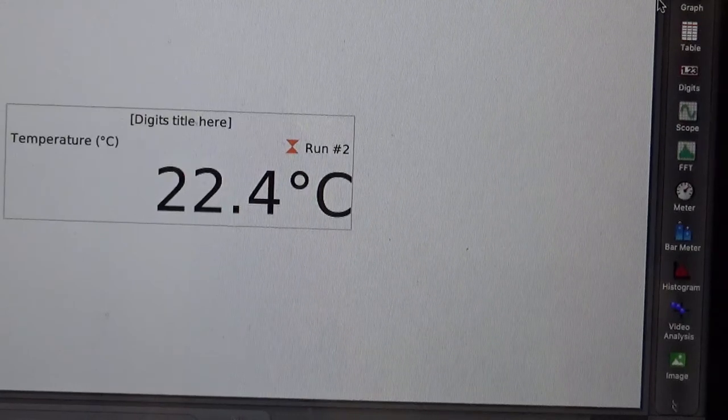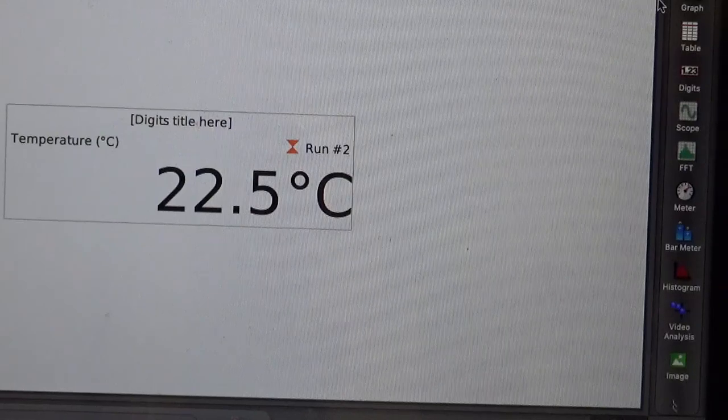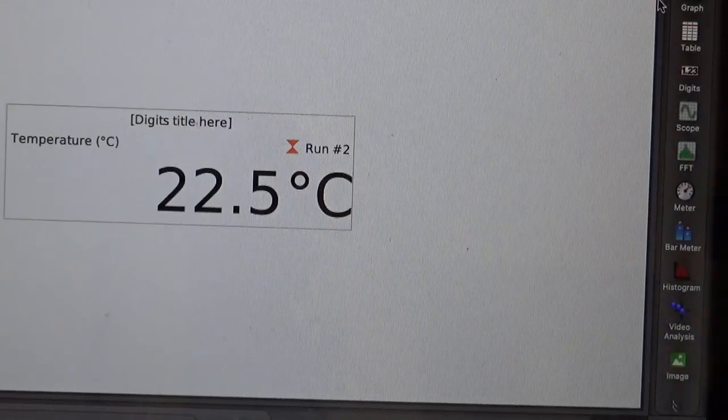I've had students end up with 50 degrees at the end of this experiment. I've had students end up with 26 degrees or even 24 or 25. That's really good. If I end up with between 23 and 27, I'll feel like it's a victory.